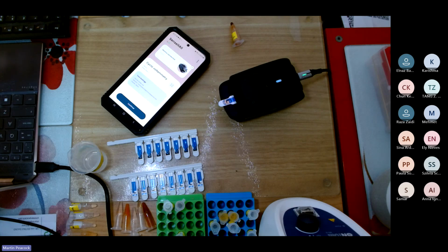Now what I want to do is quickly go to here and, whoops-a-daisy, I'm going to do a classic experiment, ferricyanide. Ferricyanide is actually quite useful, and we use it a lot in our assays. It's quite predictable, quite stable, quite easy, quite non-toxic, quite easy to get hold of. Classic cyclic voltammetry of ferricyanide, but I'm going to do it slightly differently. I'm going to gather the oxidation and reduction of ferro to ferricyanide like a classic cyclic voltammetry. I'll have an initial potential, I'll go to the final potential, and then I'll go back to the initial potential.